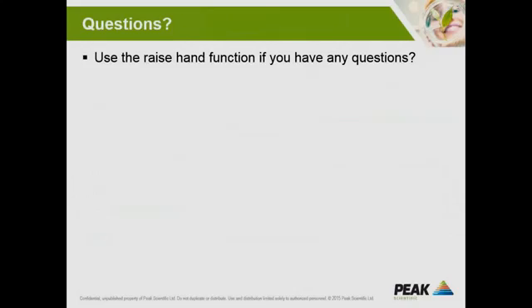Sure. I think we're really running out of time. We'll take the last question from Mr. Nilesh. He says, is the gas pressure for the gas cylinder the same as for the FPD and ECD detectors? The pressure? Gas pressure? Yeah, the pressure. So the pressure from the generator is suitable for any other detectors, yeah.